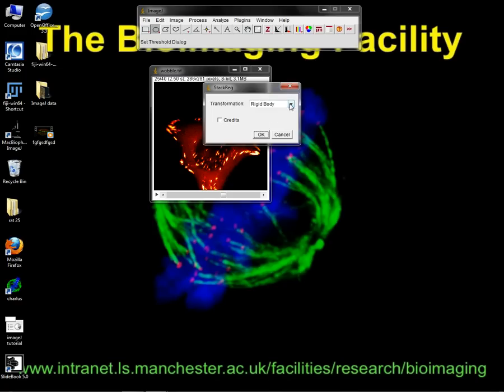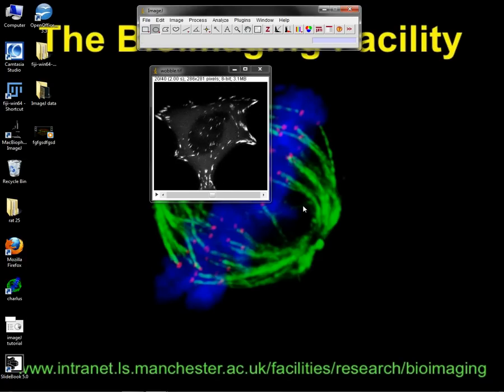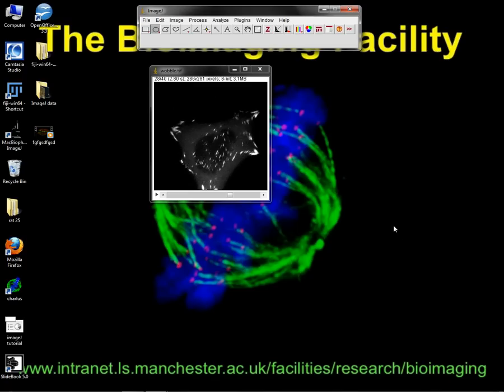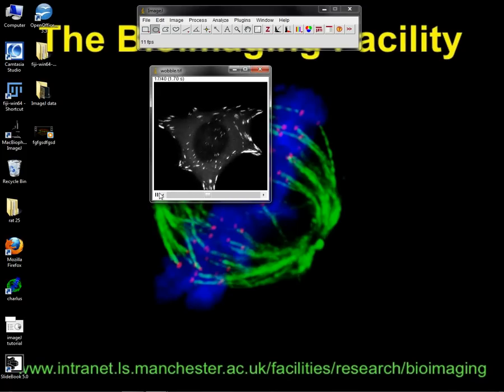How do you want to do it? Yeah, there's a few different ones. Again, you'll have to have a play, decide which one works better, and you run it. And okay, it's doing something. So if you have a big data set, it's going to take a lot of time. And then you go, okay, what's happened there? How has it aligned this set? And it's kind of tricky to see. So if we look at this now, you watch that. It looks stationary.